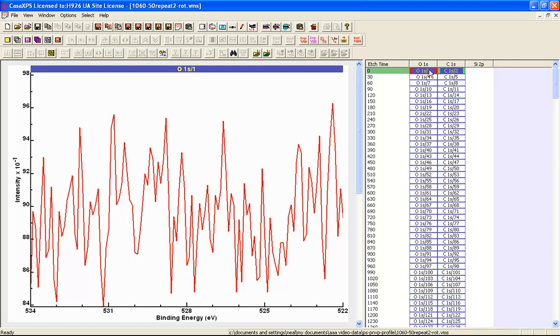However, the measurement does not include nitrogen, and the reason the nitrogen spectrum was omitted is that one of the concerns as part of this profile is that X-ray exposure may degrade these polymers. To limit the X-ray degradation, the number of scans was limited to the oxygen and the carbon.